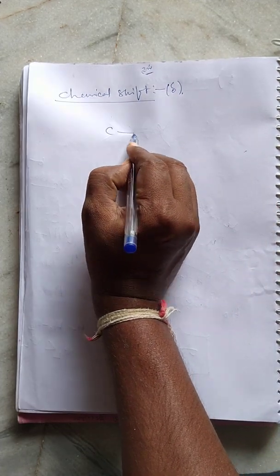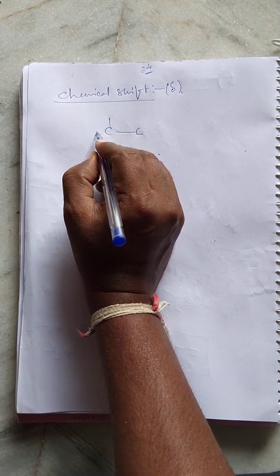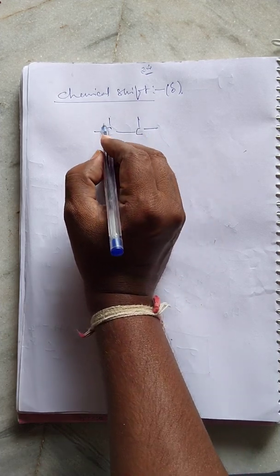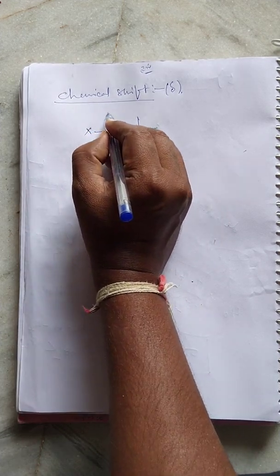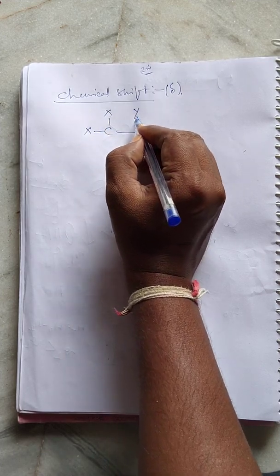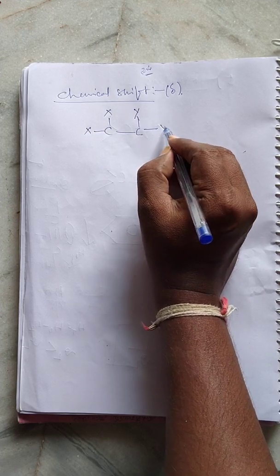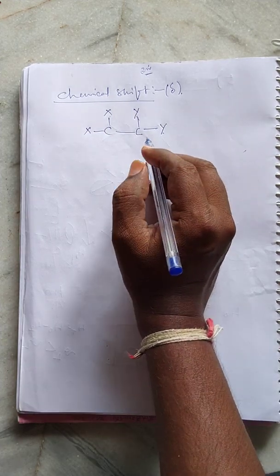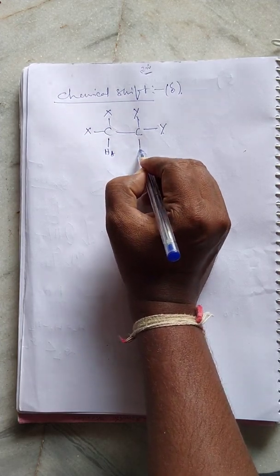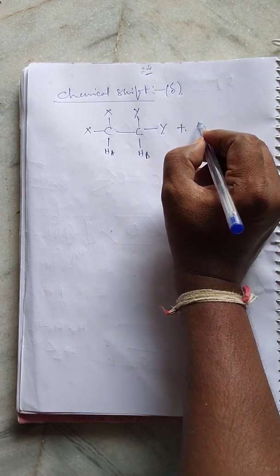So generally this NMR spectroscopy is a tool to identify the structure, especially proton NMR, which is used to identify the structure or the connectivity of organic molecules, right? So here this is the chemical shift value.